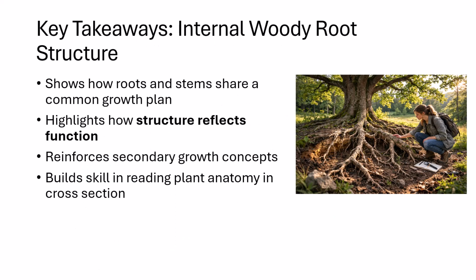This activity helps you see that woody roots and stems are built using a similar developmental plan, even though they serve different roles in the plant. It reinforces how secondary growth works and how plant structure reflects function, while also strengthening your ability to interpret real anatomical cross-sections.